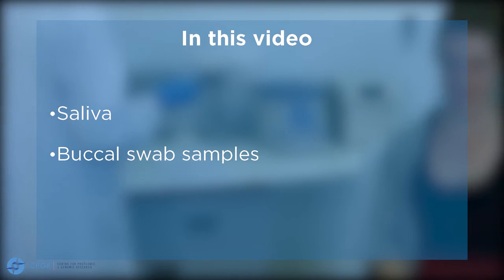In this video, we will demonstrate how to collect saliva and buccal swab samples.